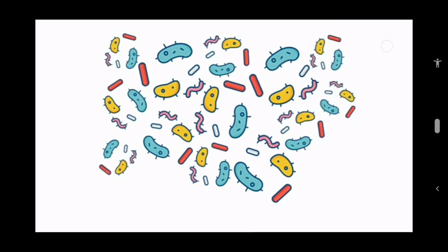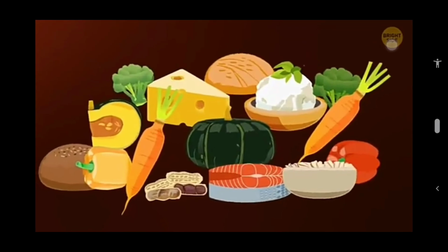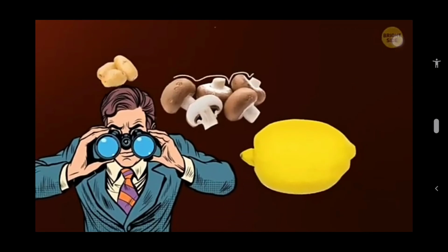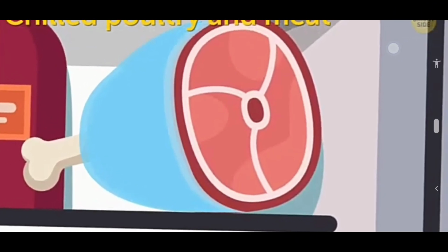As a conclusion from our experiment, we can conclude that all microorganisms have a defined temperature, humidity, nutritional source, and oxygen range for them to grow. If bacteria or pathogens land and grow on the food, it will cause serious diseases if the food is consumed by humans. There are lots of bacterial spores floating everywhere in the air. So to prevent our food from being spoiled by a pathogen or bacteria, we must use the right way to store our food.